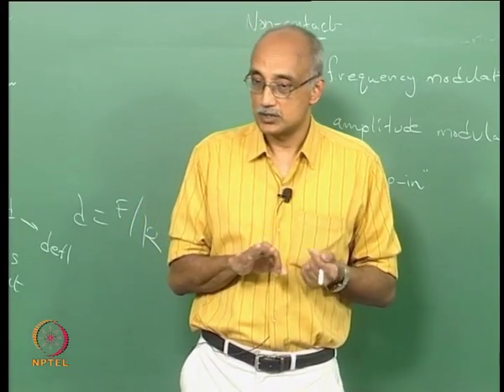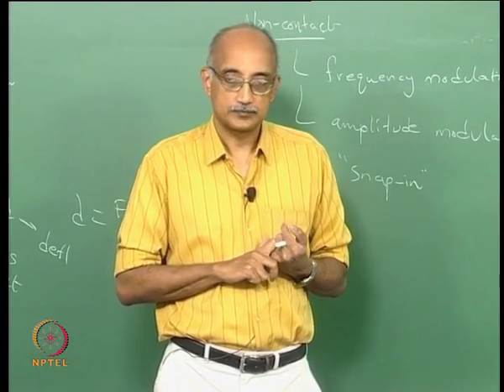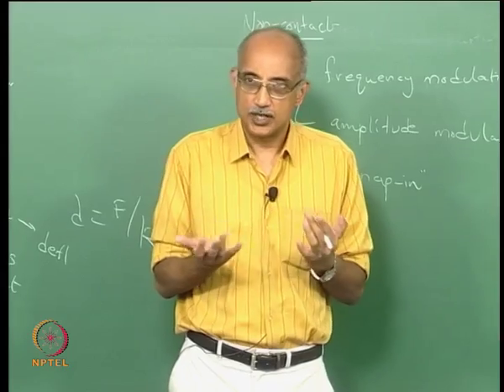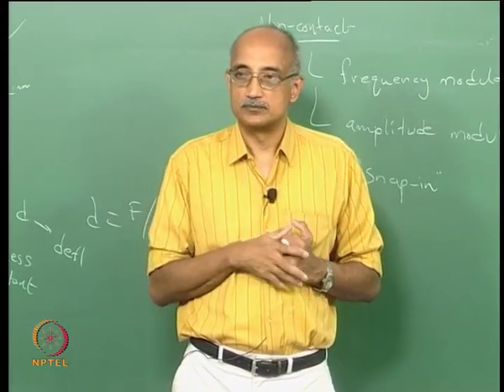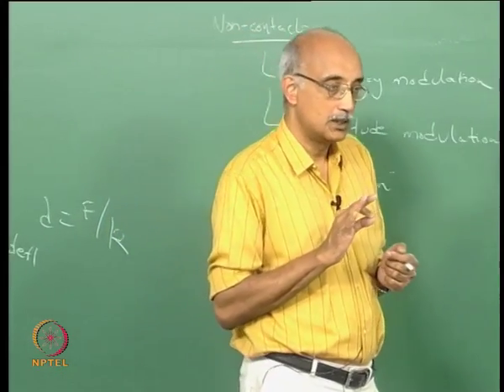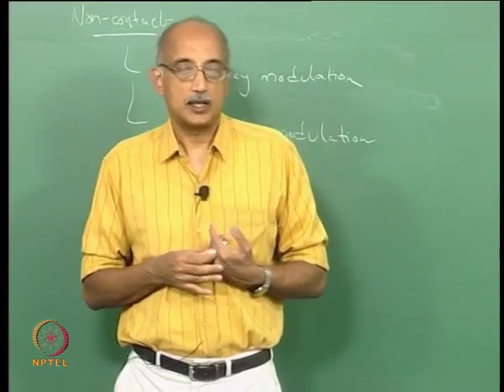And the third statement he made, which is very crucial, is that if you have a mixture of various substances, then the individual diffraction patterns are still retained. So, you do not get a mixing of diffraction pattern from various elements or materials that are present. So, when you take these statements together, what does it mean? The X-ray diffraction pattern of a material is like its fingerprint, and just like a fingerprint for humans, every material has a unique XRD pattern. And so, if you can obtain the diffraction pattern of any substance, you can identify what it is, just like fingerprint analysis, right. So, how do you make X-ray diffraction happen?